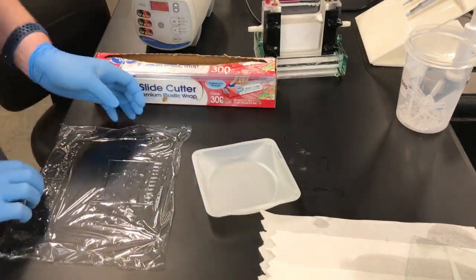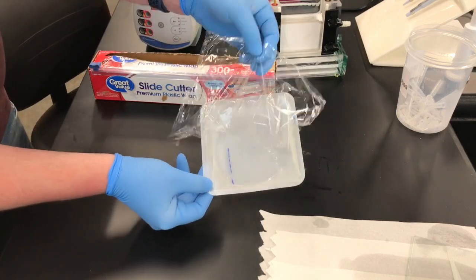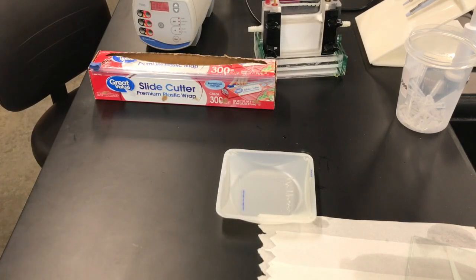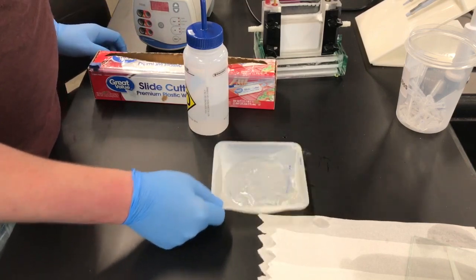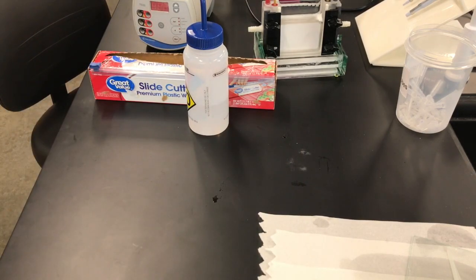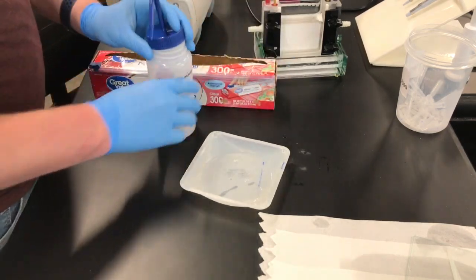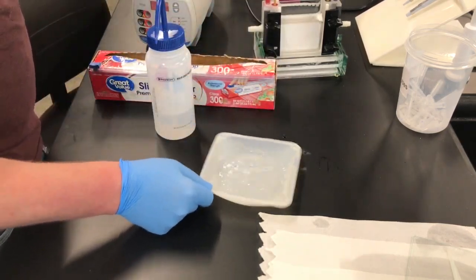Now, get a weigh boat and then flip the saran wrap over in order to transfer it from the saran wrap into the weigh boat. Rinse it off with a little bit of water. You really want to rinse off any of that extra SDS buffer because it will interfere with the next part.